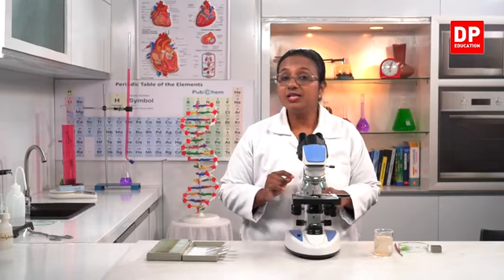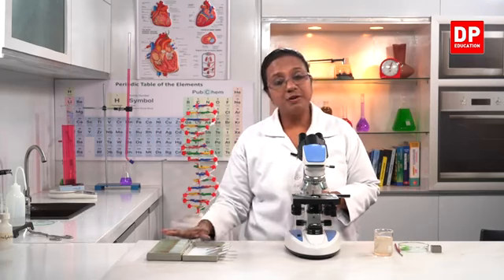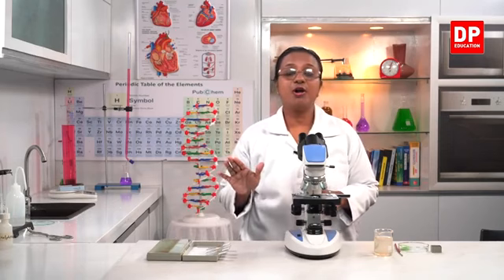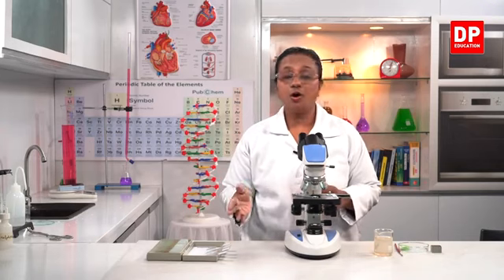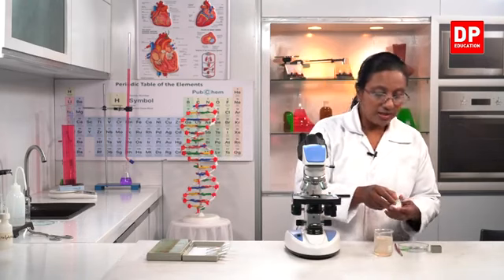So those are the unicellular organisms made up of just one cell. At the same time, I have here the permanent slides. Here also I can show you all the unicellular organisms as well as how cells are arranged in a multicellular organism. So I will start off by making the temporary slide.